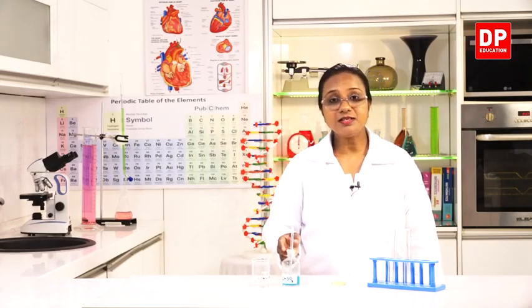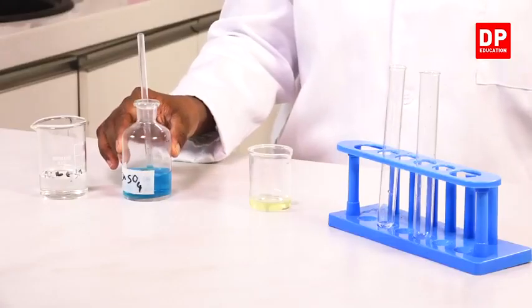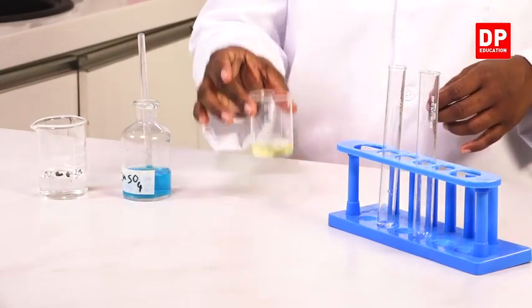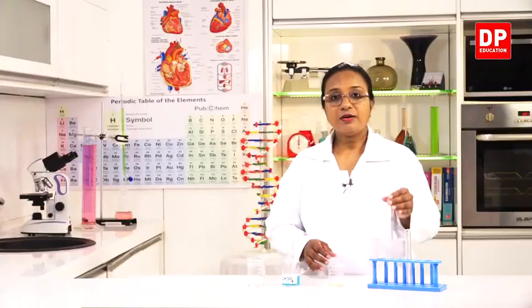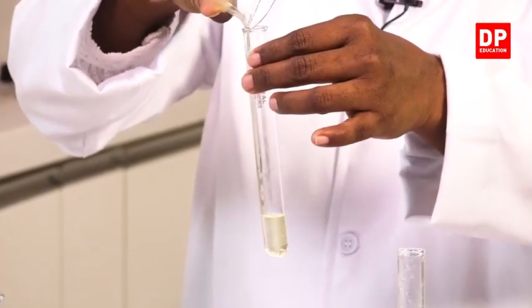The reagents, the two reagents, sodium hydroxide solution and the blue color copper sulfate solution. I have already taken the egg white into a small beaker. Now I will transfer the egg white into a test tube. Okay.